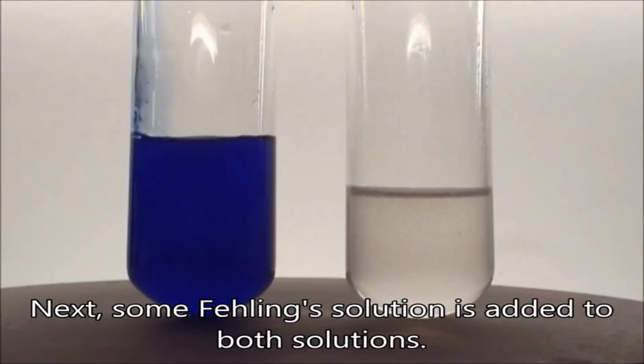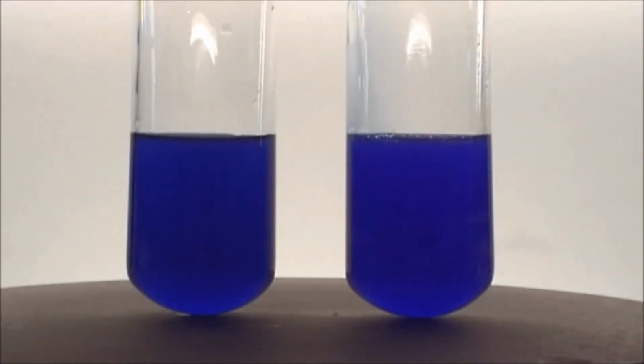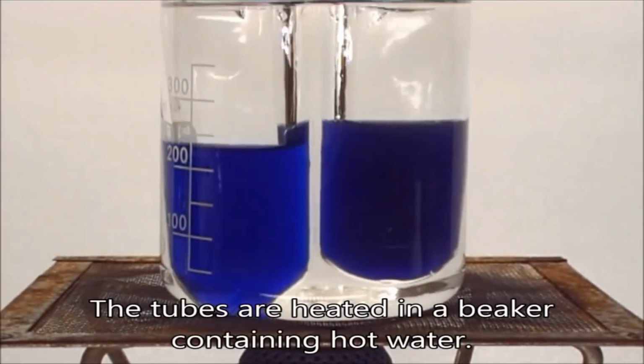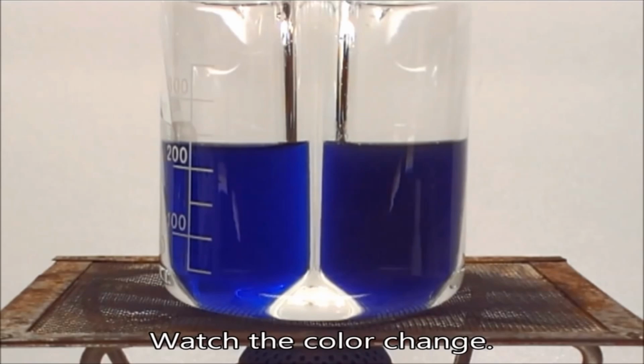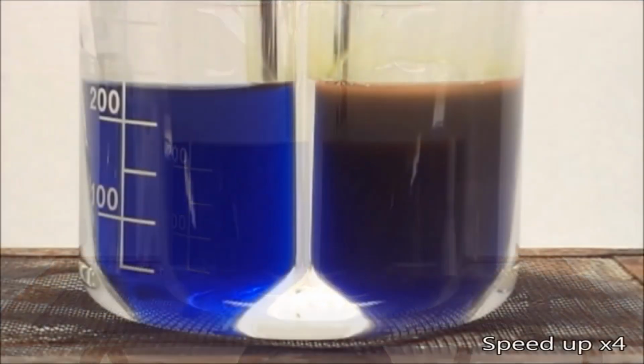Did you see how its color is blue? It has a blue color in both tubes. We heat the beakers. Okay, we put them in a water bath, not on direct heating. I want you to observe the right tube. You will see how there is a change in color gradually, not quickly. See how the color is turning into red brick precipitate because the right tube contains glucose. Glucose is a reducing sugar.